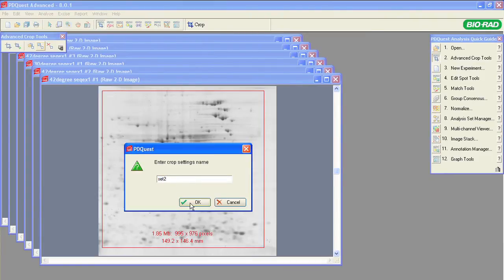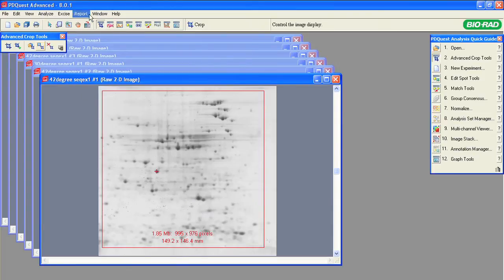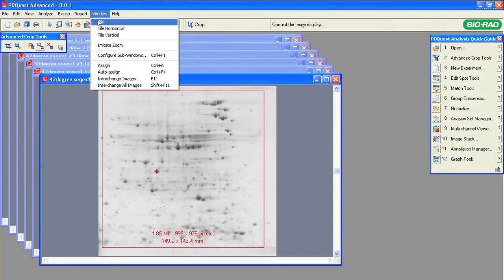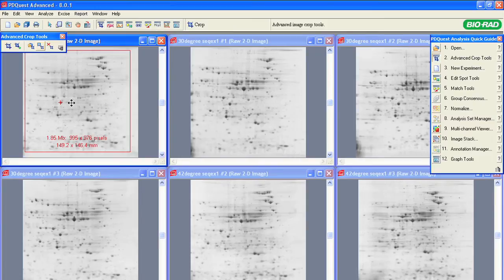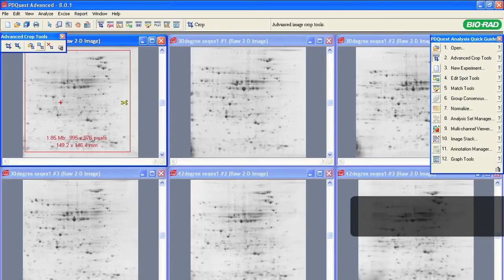To easily see all the images in the stack, you can use the Tile Display option under the Window menu. When you move the cursor away from the center of the image, the cursor becomes a scissors icon.